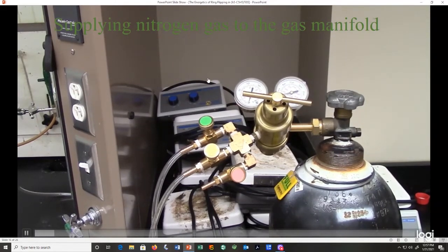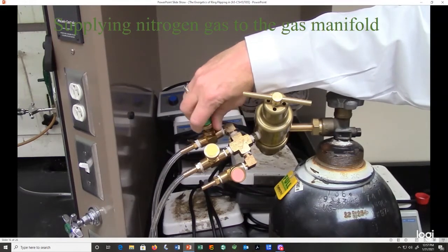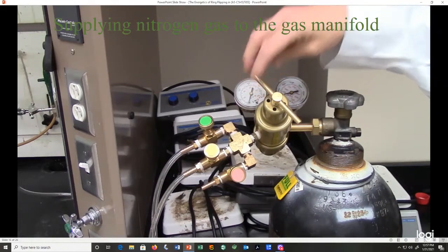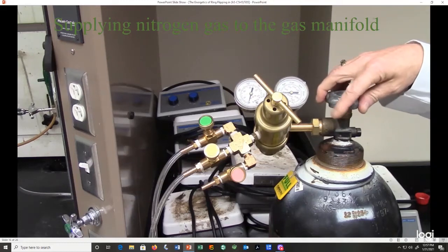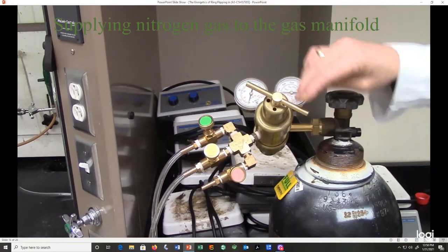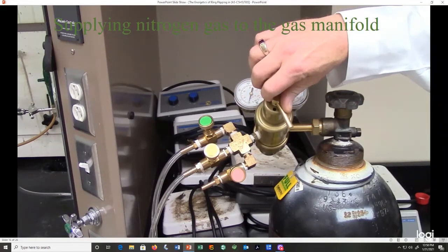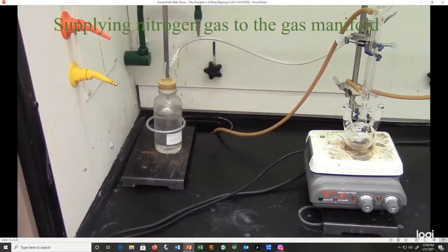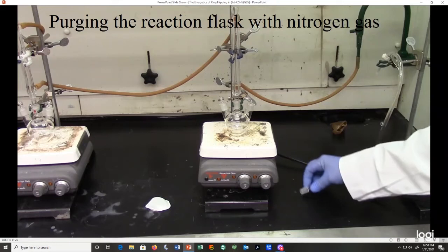So the first thing that we'll do is we'll open up this valve to the gas manifold. And we'll make sure that this valve is in the position where there's no exit pressure. We're going to turn the nitrogen tank on, and we're going to slowly close down this valve until we see just a little bit of nitrogen getting to the gas bubbler. So as I was turning that valve, I was watching the gas bubbler, and you can see that we're getting about the right flow of nitrogen going through the system. Now we can purge the reaction flask with nitrogen gas.